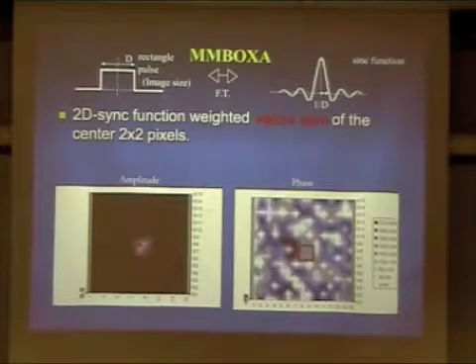And the purpose of unbending is also trying to achieve the point where everything is concentrated in that spot. So ideally, if you unbend everything, at the end, the whole image should be your crystal. So that's why it looks like this. And all that weighting has to do is to make it possible to fit things in sub-pixel resolution.